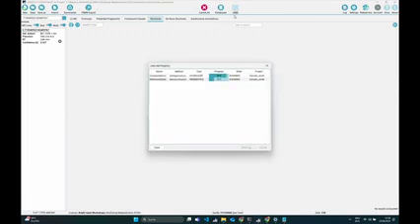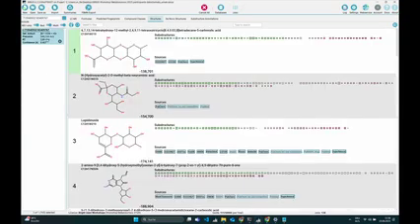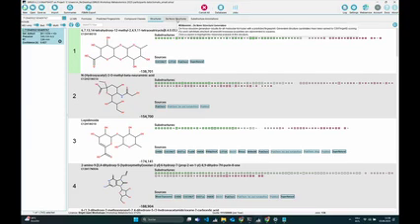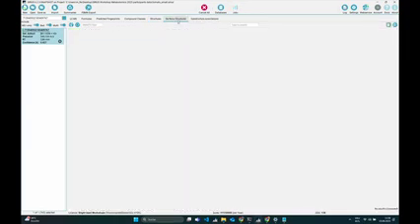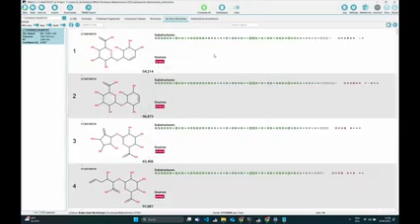Okay, I hope it doesn't take too much time anymore, but maybe I can click on this already and show you something. So what will soon appear now is in this de novo structure tab, we will then hopefully get some de novo hits. I think it shouldn't take too much. Yeah, it's already perfect timing, so it's now finished. We now have our de novo hits, and these are in this de novo panel.